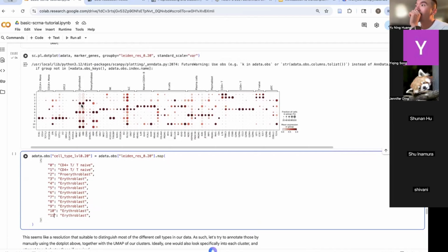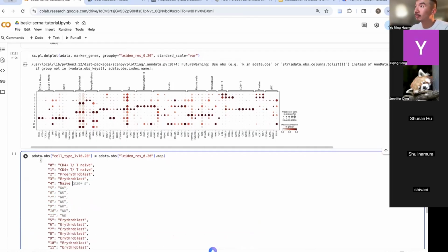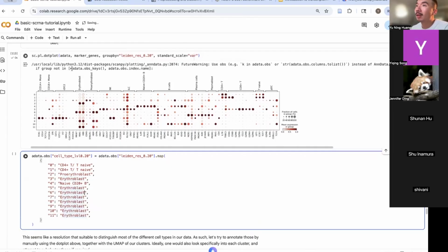So let's see, what's four? Four, okay, maybe naive CD, and then what's five? Five, I think it's NK cell. What's six?